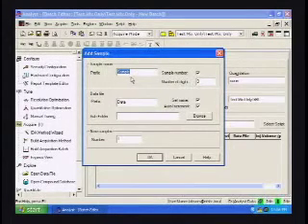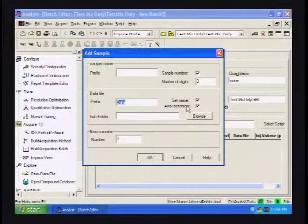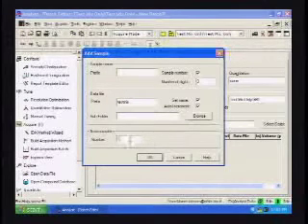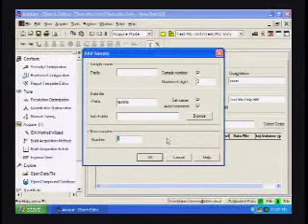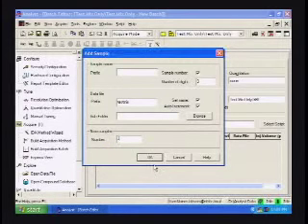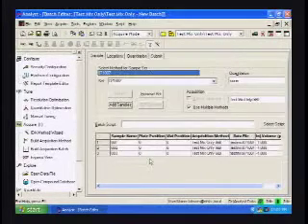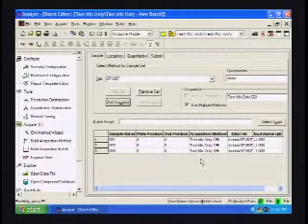Sample name prefix, let's not put anything there. The data name prefix, let's call it test mix. And let's just set up to do three samples.